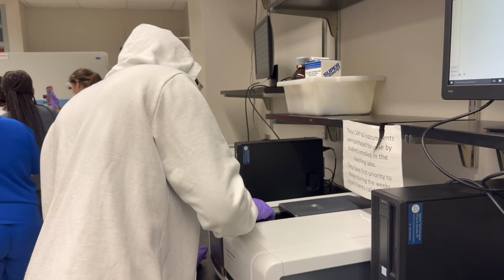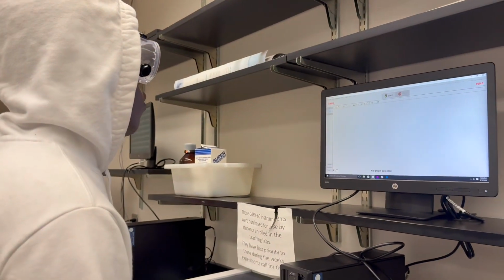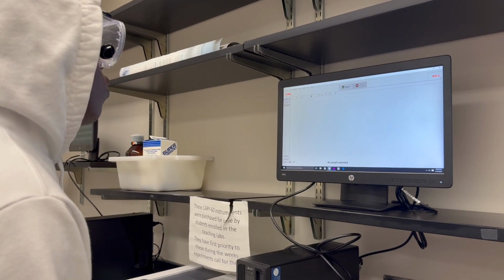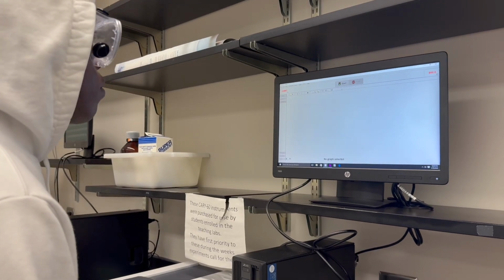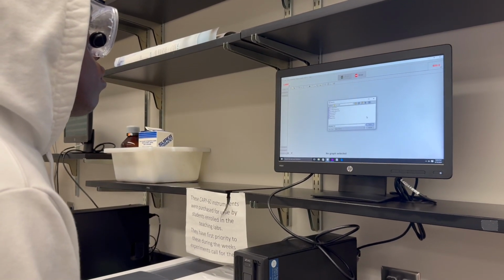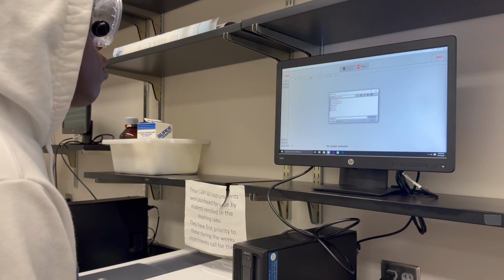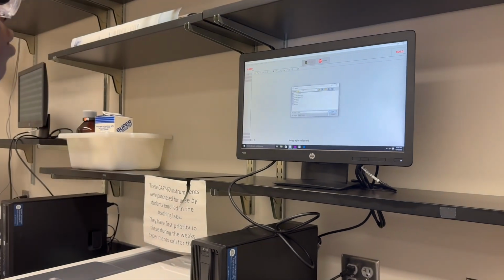Beer-Lambert law is also associated with lambda because it uses the absorption of light by a substance and the concentration of the substance. The formula for Beer-Lambert law is absorbance equals epsilon times concentration times path length, which is what we got from the zero section of our scans when using the blank.